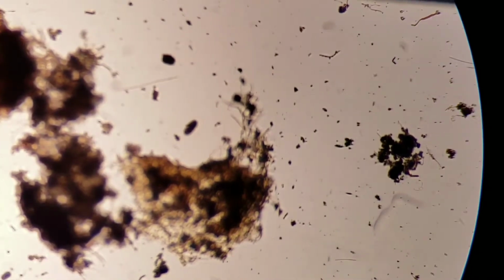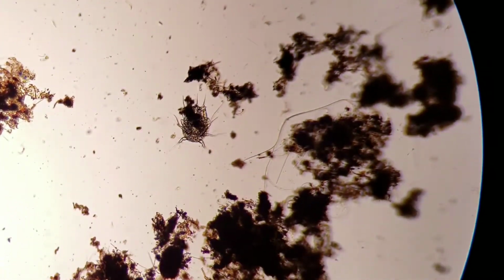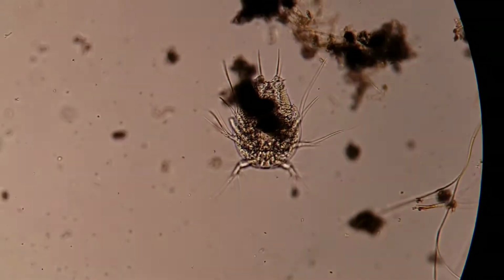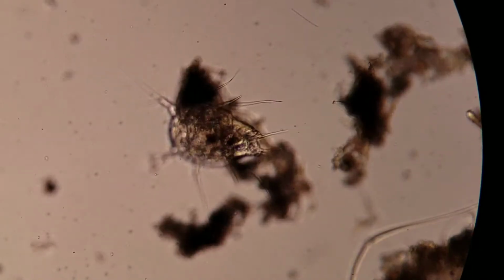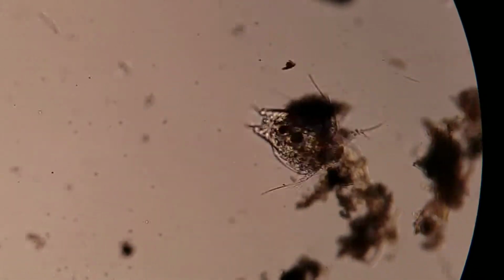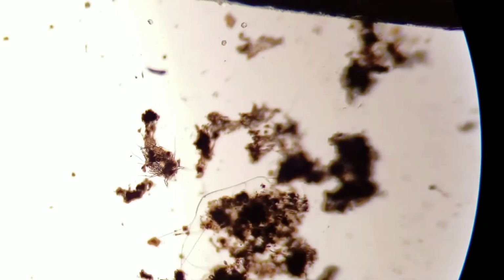A lot of little stuff swimming around, but I want to find something a little bigger. There he is. Stay still, you. Could zoom in on him nice. There, don't move. Right in the middle. It's pretty big. He's probably almost ready for adulthood. Almost looks like he has 2 eggs inside him, but they don't go inside. They carry their eggs on the outside. Yeah, he's almost an adult. Hope we see an adult. And so I can show you.